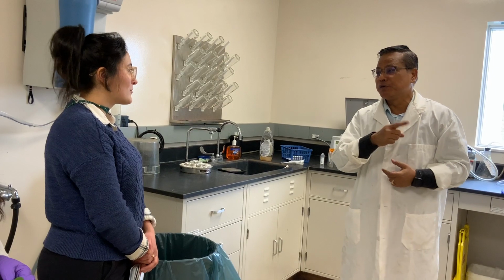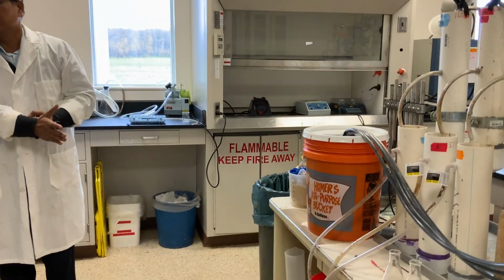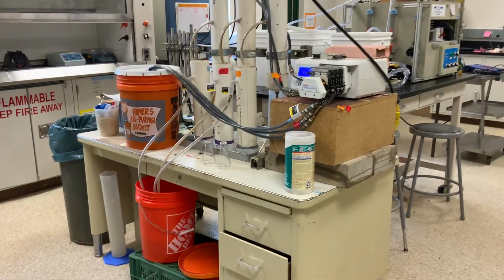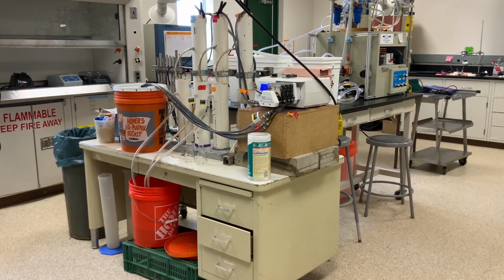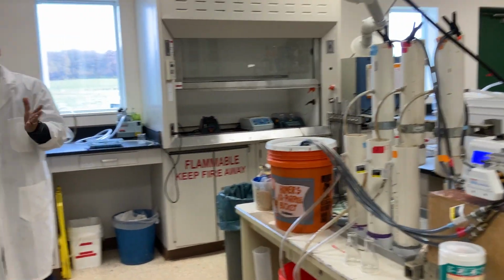You said you do it one time. This we could monitor continuously. Once the spectral signature is getting there, we could have a continuous monitoring system on a screen, and you could see this time the TS is high or TS is low, or this TS has gone to this level. Continuously you can have monitoring rather than batch time. Continuous monitoring is where we are trying to work.